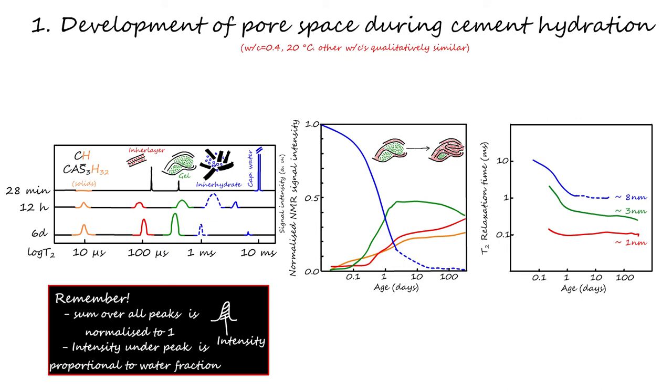With increasing hydration time, the gel pores are filled with additional layers as shown here. This must lead to a densification of CSH, which will be discussed on the next slide.